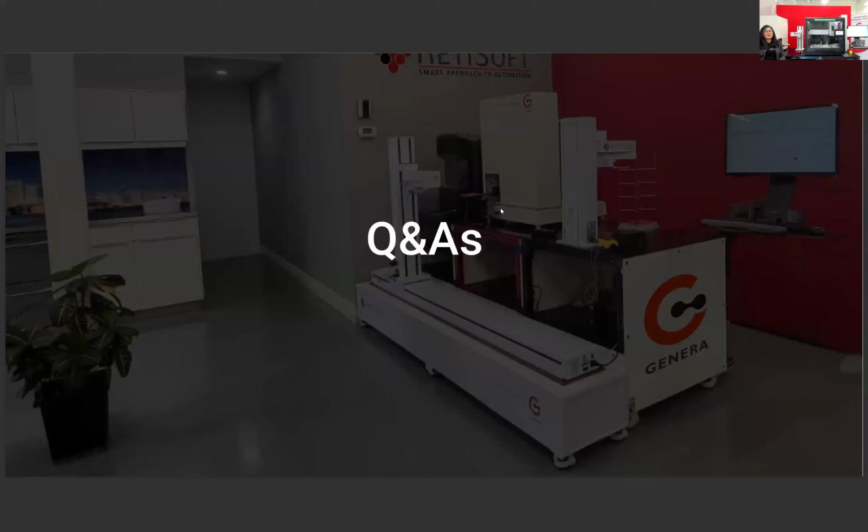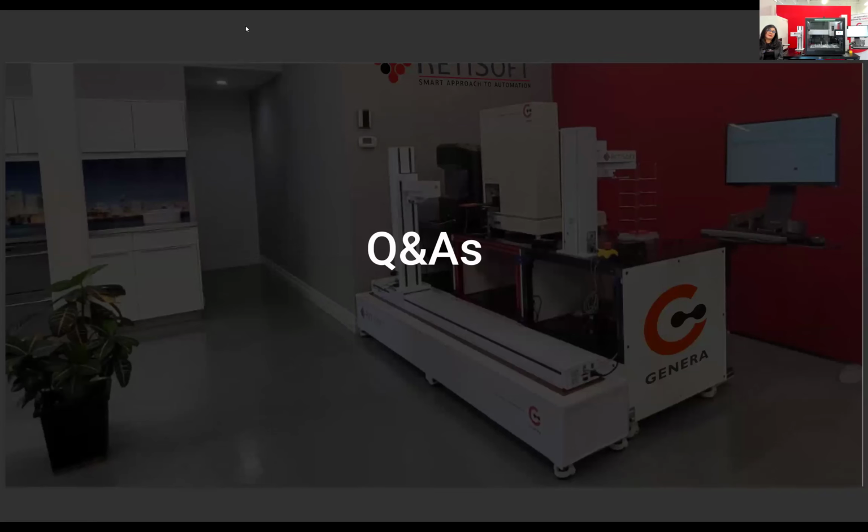And finally, I will bring it back to Nick to facilitate the Q&As. Great. Thank you so much, Igor and Elizabeth. Again, super excited about this. Really cool to get the rundown on Genera. And yeah, let's jump into some questions here.